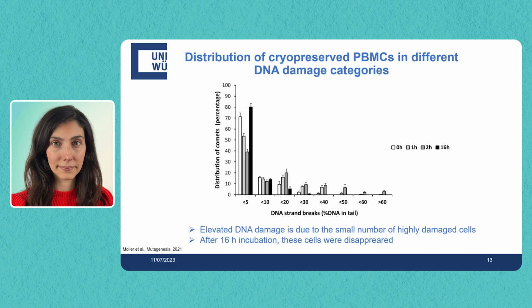We did one time point, and we didn't see a big difference, so we decided to do overnight. We also did 4 and 6 hours, and certain time points are not so attractive for students because of the working hours. It didn't show a big difference either. So we thought we would keep the 1 and 2 hour, and there is another reason for it, because for the repair assay we did here, we use UVC and H2O2. H2O2 is mostly repaired in the repair kinetics within an hour. And for UVC, we see the most repair activity within 2 hours. So we wanted to keep these 2 points.